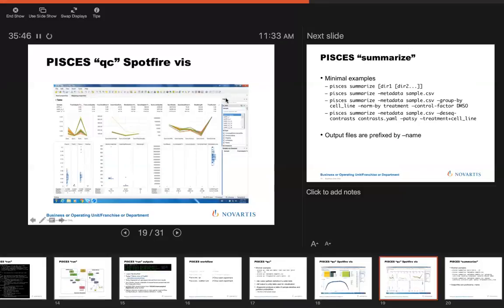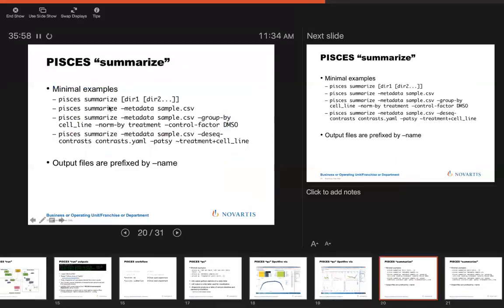to answer your question about duplication rates, that's also in here somewhere too. Some of you are probably familiar. These are just Picard QC statistics. Let's not spend a lot of time on this. It's important though. The point I want to make is the pipeline gives you QC data in a tidy matrix that you can visualize. We're doing visualization using Spotfire. You could actually just read it using your favorite tool.